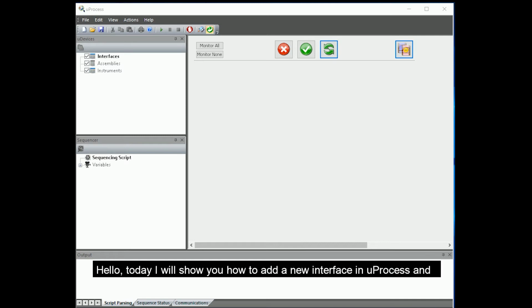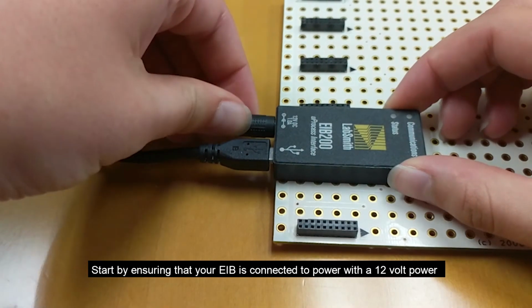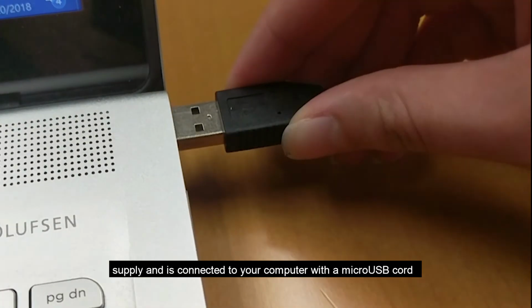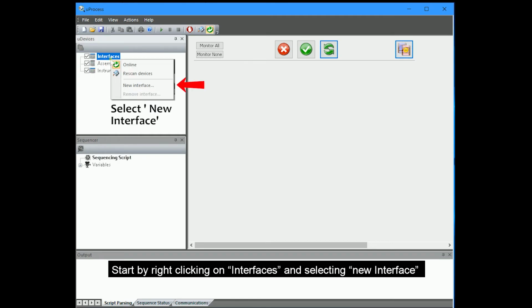Hello, today I will show you how to add a new interface in uProcess and go over some problems and how to fix them. Start by ensuring your EIB is connected to power with a 12-volt power supply and is connected to your computer with a micro USB cord. Then open uProcess. Begin by right-clicking on Interfaces and selecting New Interface.